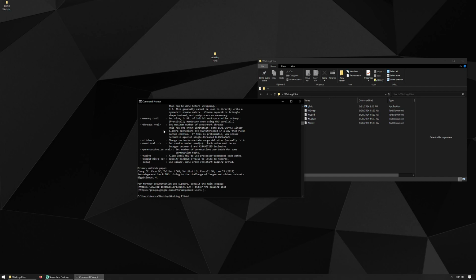And you'll be learning more about how to manipulate and open and view files in whatever the heck you're installing Plink for. So good luck with that.